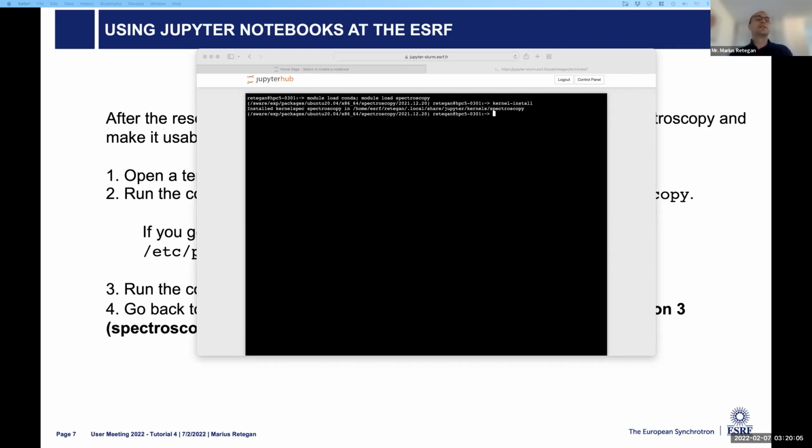Okay, there's a lot of text on top, huh? It says that you want to trace back. Yeah, that's Python related, but what it says in principle is that it's not able to write files on disk. Which is very weird, because it should not be the case.